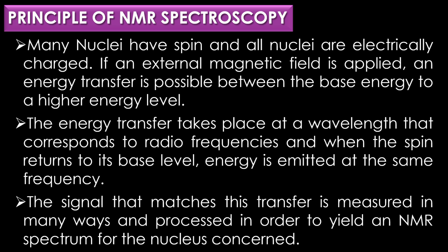The energy transfer takes place at a wavelength that corresponds to radio frequencies, and when the spin returns to its base level, energy is emitted at the same frequency. The signal that matches this transfer is measured in many ways and processed in order to yield an NMR spectrum for the nucleus concerned.